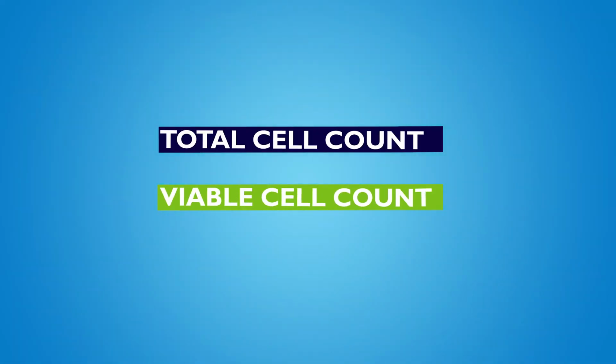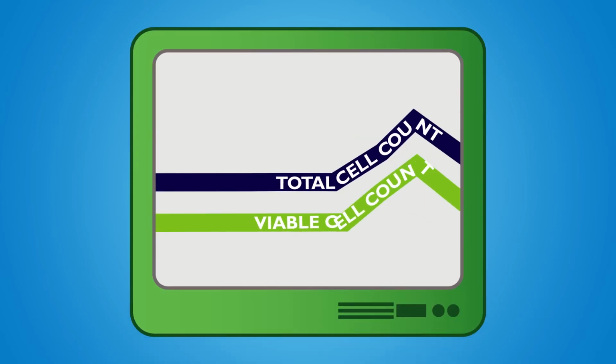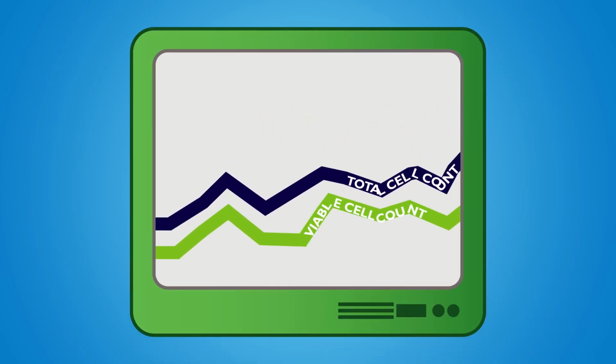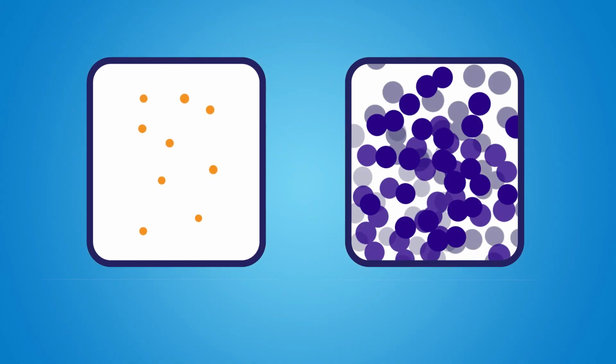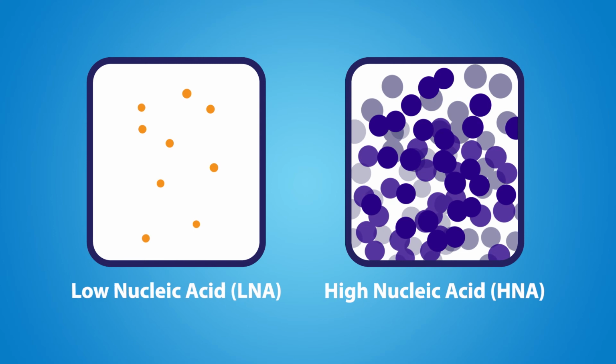With the ability to detect bacteria in water samples by flow cytometry, a highly sensitive monitoring system can now routinely report bacterial cell counts. If there is an abnormal increase in the total cell level, flow cytometry can quickly capture such change and create an alert.